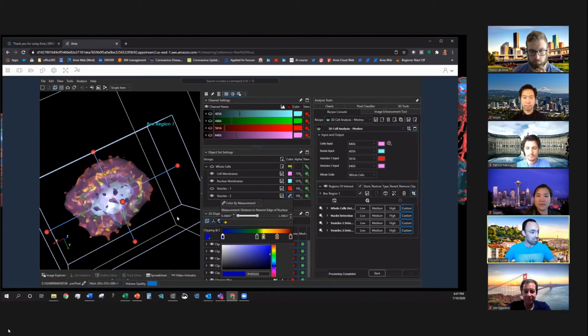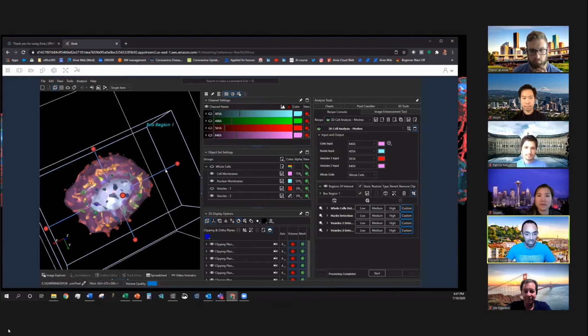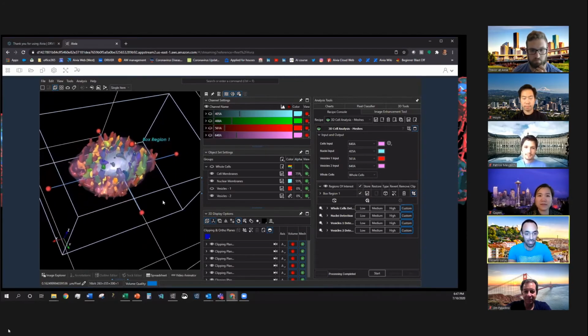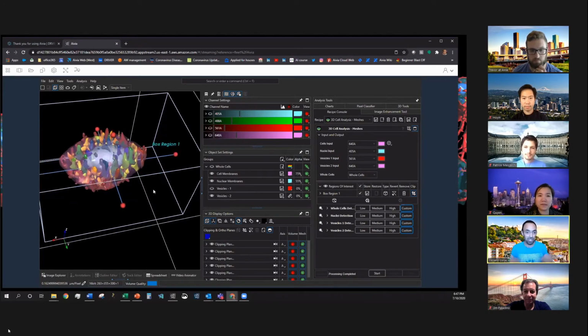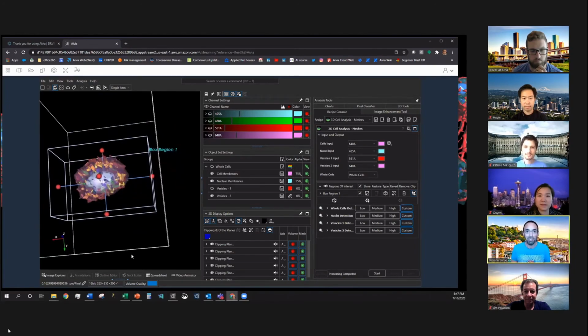And yeah, so as you can see, there's a few other people looking at what I'm doing right now. With Aivia Web, you can actually transfer. So if I stop using Aivia Web right now, I don't have to do anything. And Trevor is sharing this session with me, and we're basically looking at the same data set, and he can carry on and do whatever he wants. So I think he's going to do some nice videos for us.